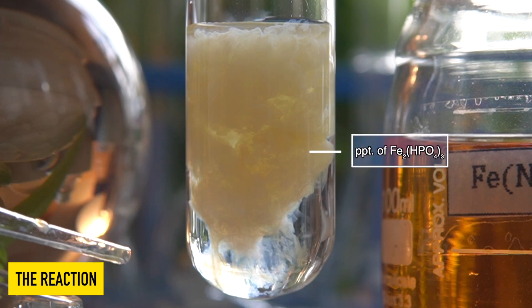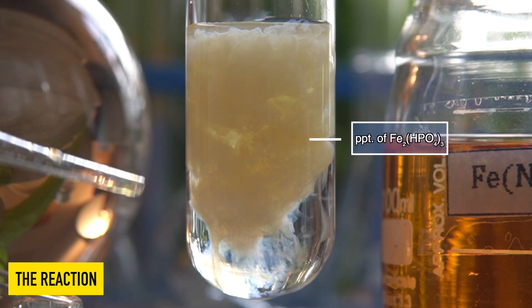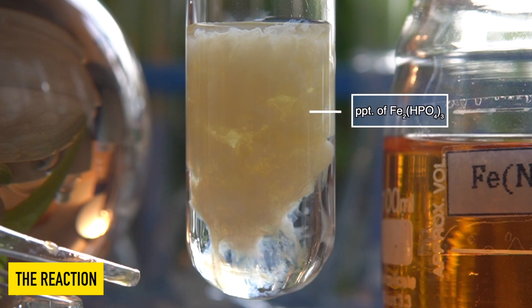The yellowish-brown solid that has been formed inside the test tube is iron three phosphate.